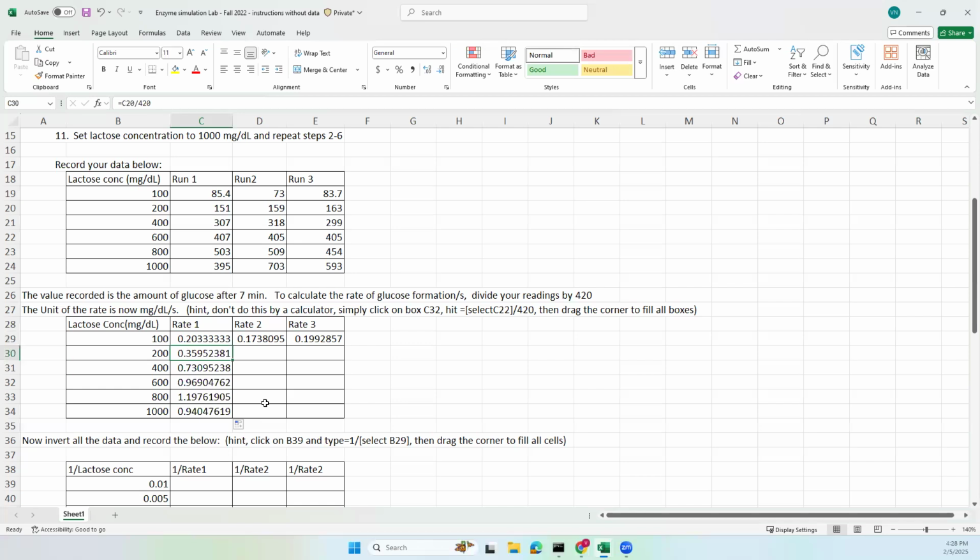So now you're dividing that by 420, okay? You can also drag that sideways as well. You can highlight the whole column like that and go back to this very right corner. When it changes to this little black arrow, you can actually just drag it to the next square, and it will then copy the same command all over, okay?